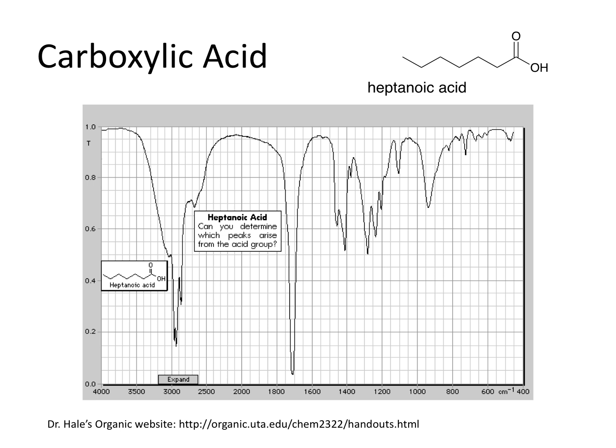So the next one's a carboxylic acid. Kind of like an alcohol, it has an OH peak. It has the carbonyl, so we'll label that one first. That's here, again long and skinny. And then if you look at the OH peak, it does have one, but see how it's smooshed to the side? It's round, but it's also blended into the 3000 peak, so it's lower. So it's not lumpy like the NH because that was totally separated. That's how you're going to be able to tell them apart. You can also go back to this part of the video if you need to. But that's the OH peak for the carboxylic acid. That's the second key peak that you would label.